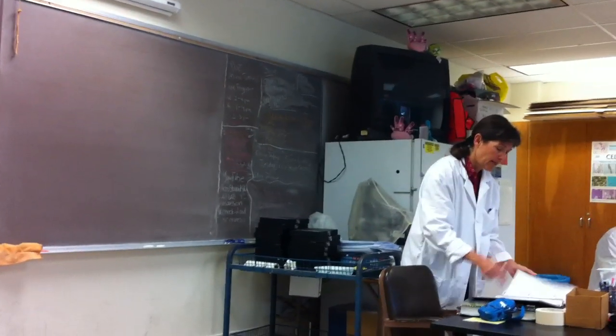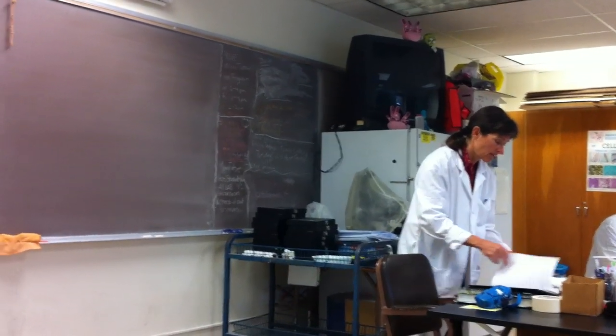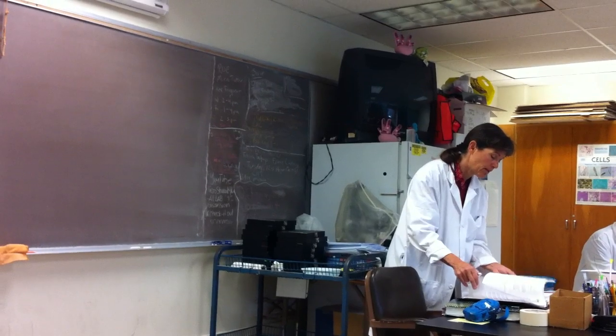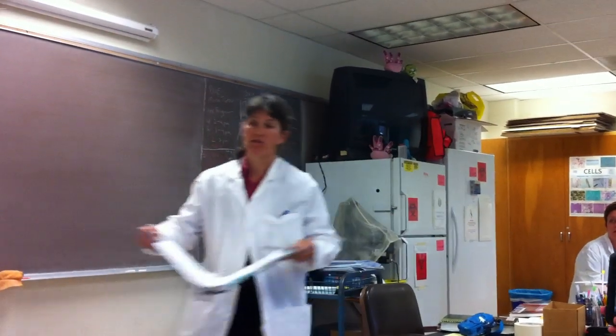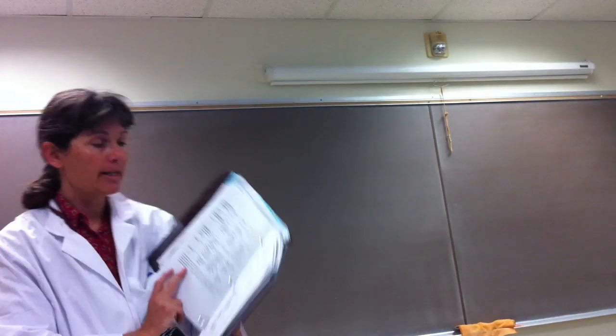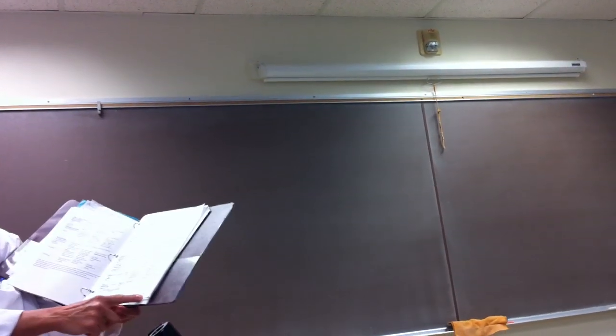Our discussion of Chapter 10, Microbial Growth. And what we're going to do then is Part 2, which is our discussion of selective and differential media. So a reference here is going to be Table 2 on page 90.